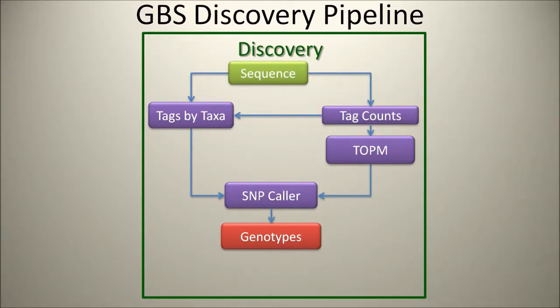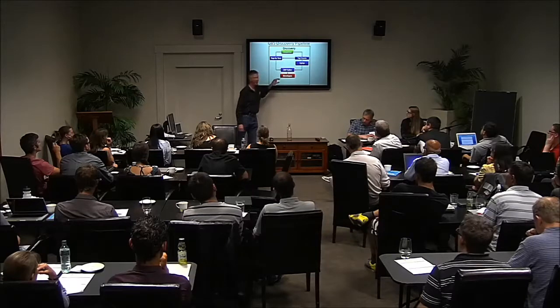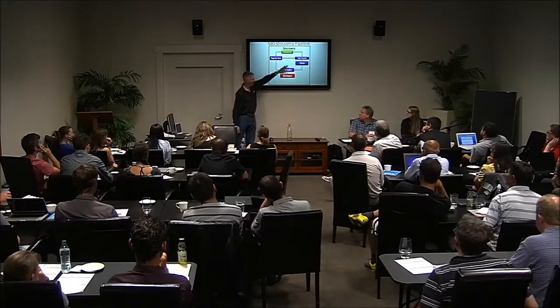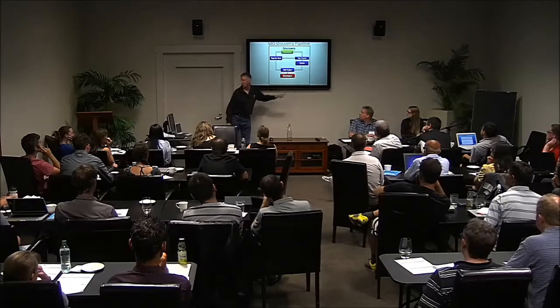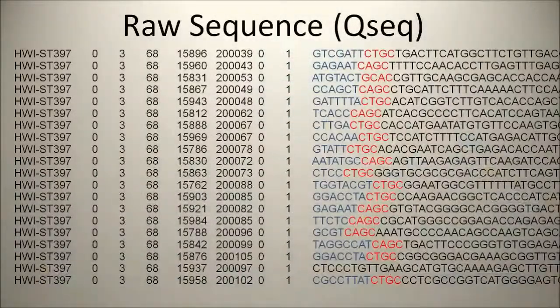This one, I think, we've had many, many iterations of this diagram. This one is one that I think conveys the ideas pretty well and is reasonably simple. It has all these parts with the arrows telling you where things are going. Information is coming from the sequence and informing this, and so on and so forth. And finally, the goal is to get from here, the sequence, to the genotypes, right? That's our goal.